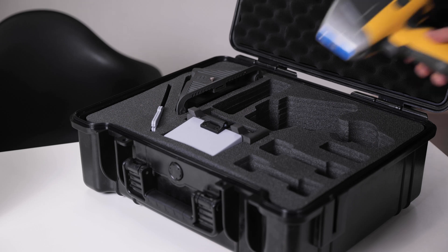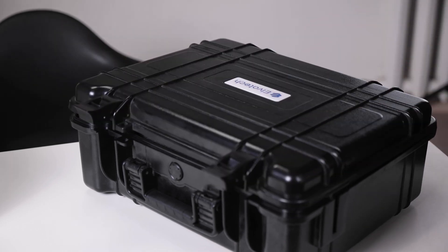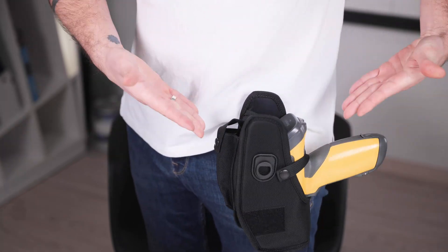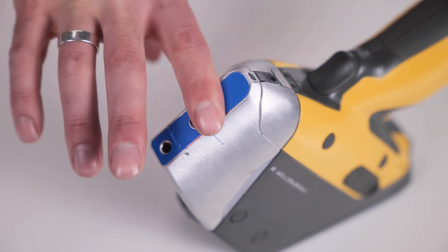Safe usage of the analyzer starts even before you power it on. Always transport and store the device in the special light protection case or holster for optimal protection. For handheld analyzers, it is important to always perform measurements using the protective cartridges. This ensures accurate results and prevents damage to expensive analyzer components.